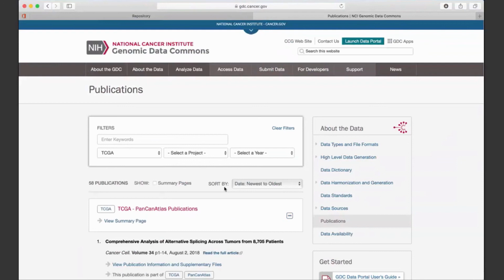The challenge we first met was that the first production was about 3 to 4 years ago, and there were a lot of data resources and tools that were not compatible with the new reference genome. But nowadays, since HG38 has been released for almost 6 years, I think most of the modern tools have been updated to be used with this new reference genome, and it's definitely better. And you can see most of the other big genomic centers also move towards using this new reference genome instead of staying with the old one.